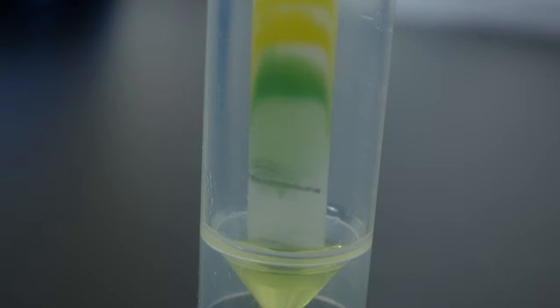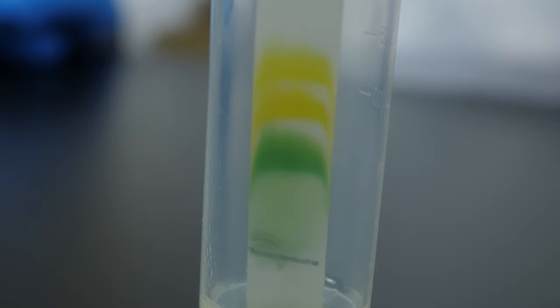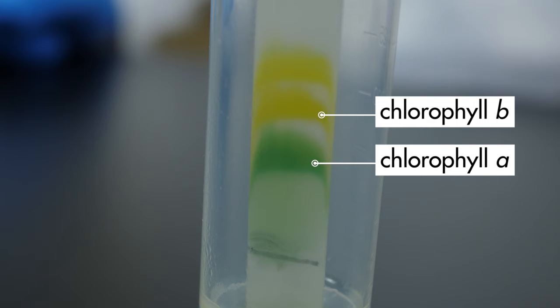After about 45 minutes, we can see three lines of color on the chromatography plate. The green line was made by the chlorophyll A. The first yellow line was made by the chlorophyll B. The second yellow line was made by carotenoids.